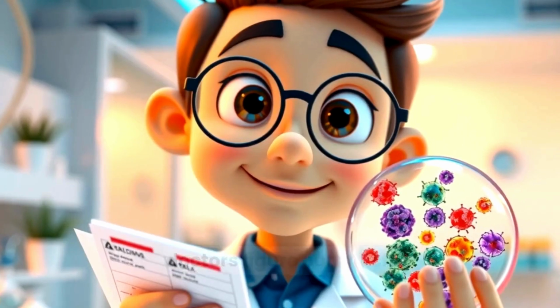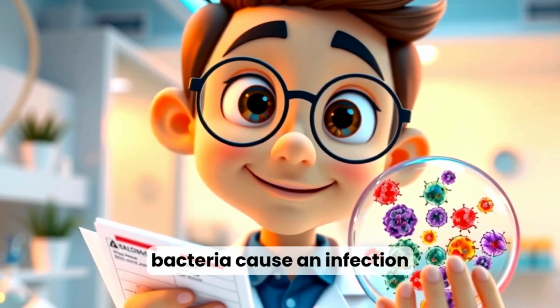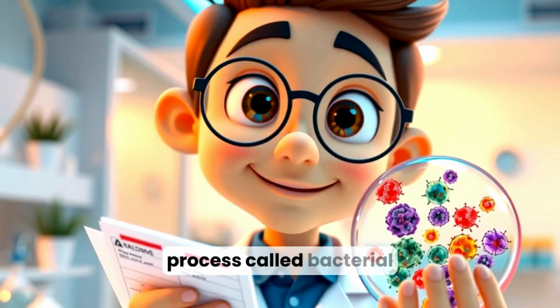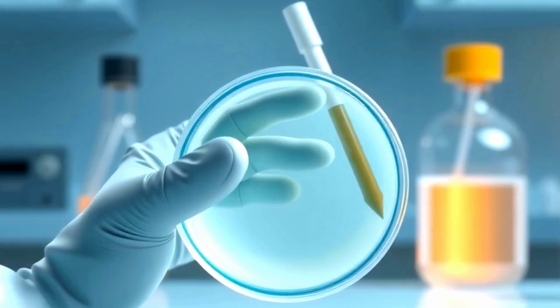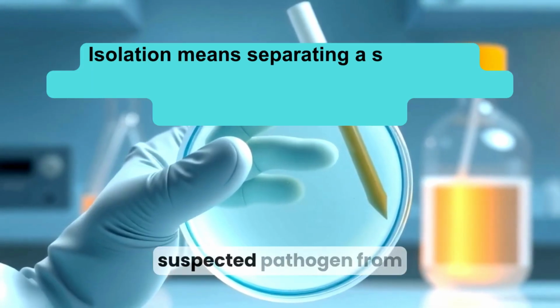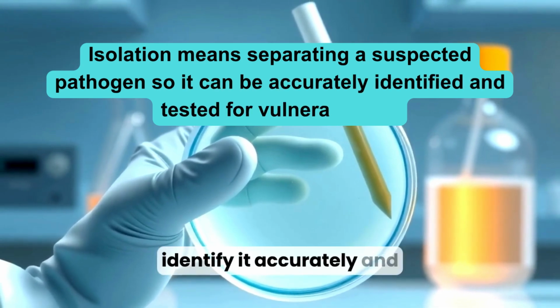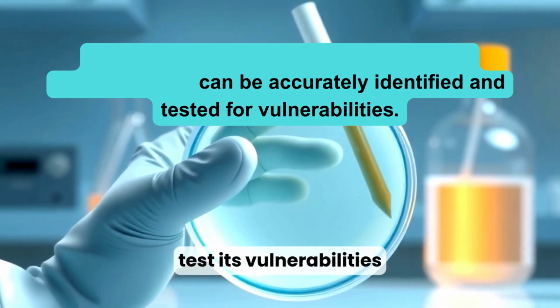Have you ever wondered how doctors figure out which bacteria cause an infection before choosing treatment? It starts with a controlled lab process called bacterial isolation. Isolation means separating the suspected pathogen from everything else so we can identify it accurately and test its vulnerabilities.